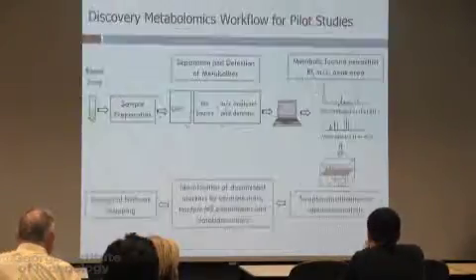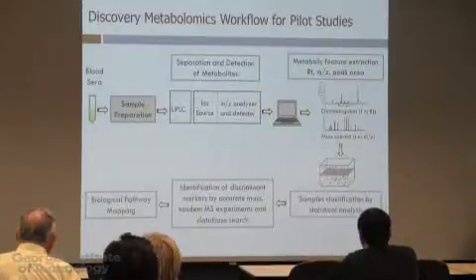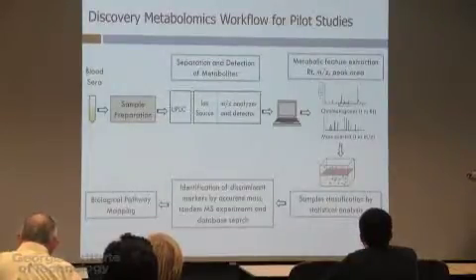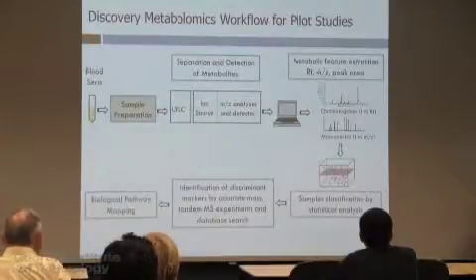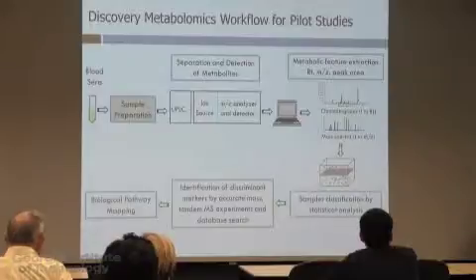Okay, so I'm going to show you the simplified protocol, which is to take serum samples, we precipitate the proteins, okay, and this actually sounds simple, but this is where your OCD has to kick in, because garbage in, garbage out. Trust me, if you don't do this right, everything else is a waste of time, and we've been there, okay? We've spent 1.5 years on samples that were a waste of time.